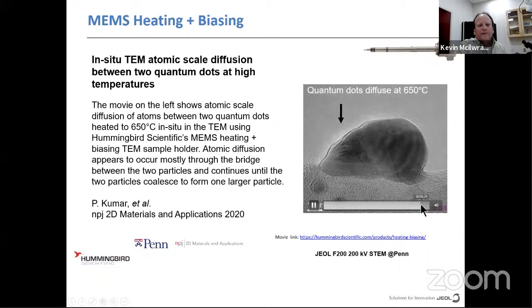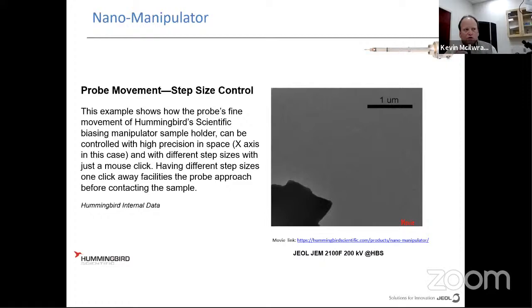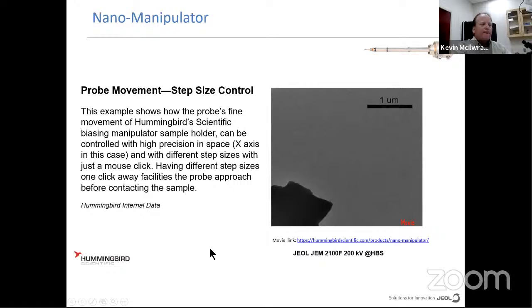I'm going to speed up a lot of these videos because we don't need to watch the whole thing. Another thing is we have probe control on these holders. So we have very fine control to be able to move and push on things and do things like nano indentation. We can check how sticky something is. We can push on it around. A lot of different things.